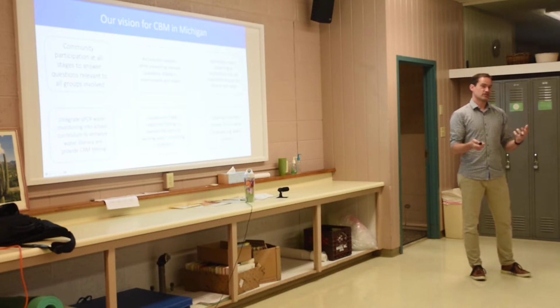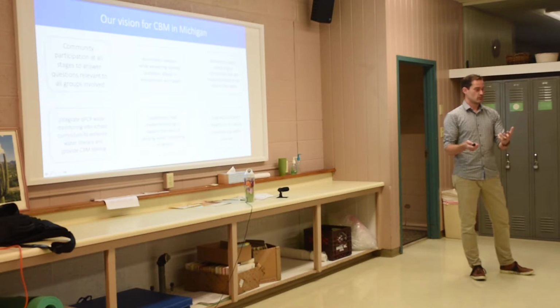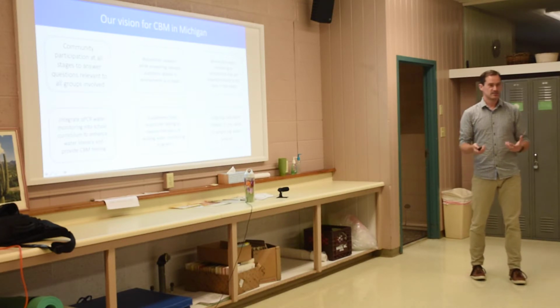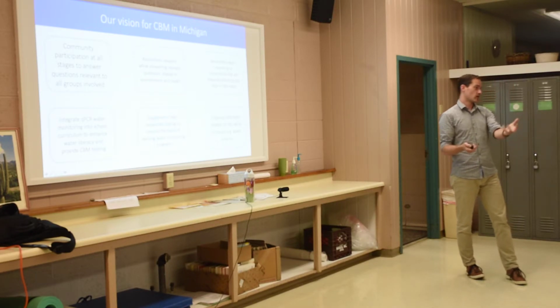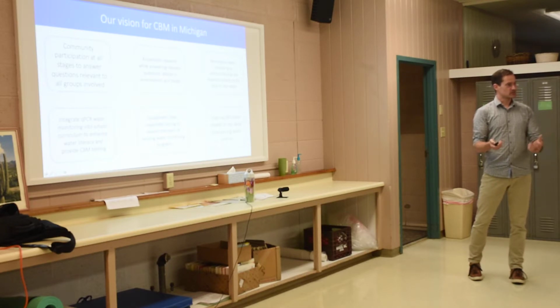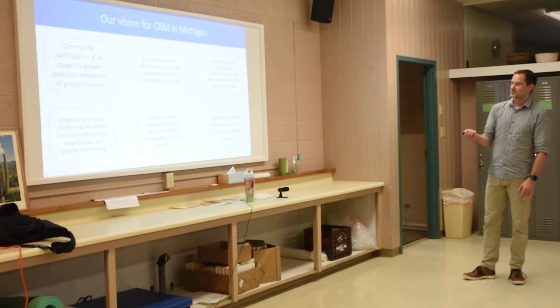It also allows you to integrate really interesting genetics and biology into a curriculum at an interface and a stage where they're probably learning about cell biology and genetics. So you can teach them about how it works in a cell, and then you can show them how it works in a tube. And you can actually get them to do it in a tube, and they can run a sample that's relevant to your lake. So this is a big thing for us.